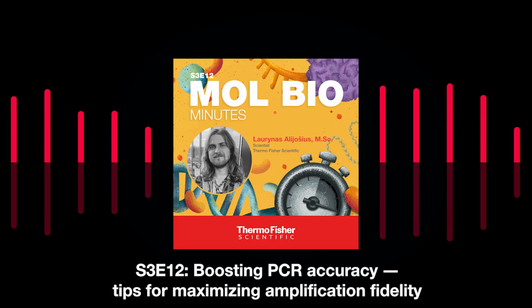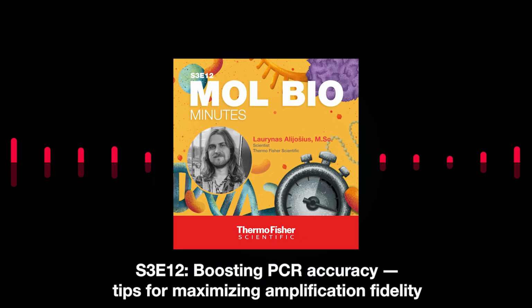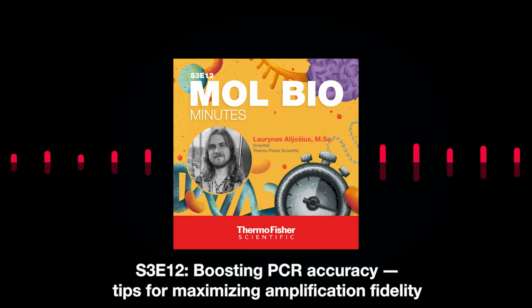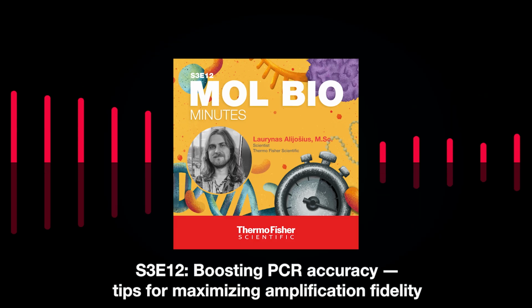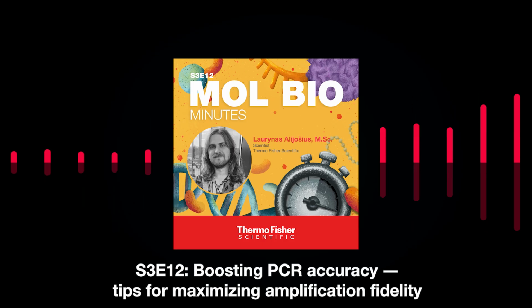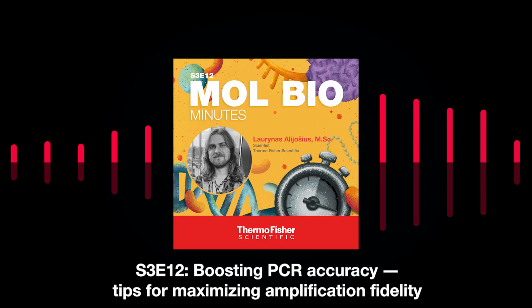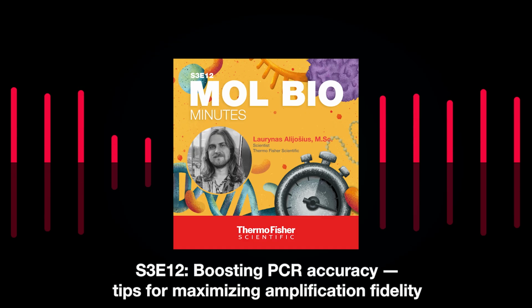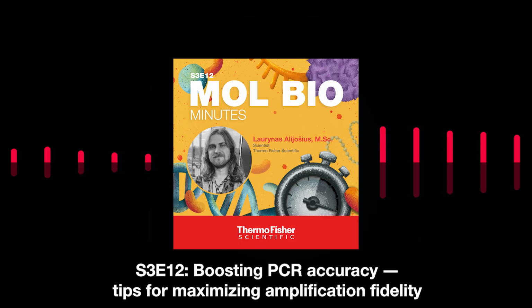There are other benefits as well. If you're using accurate DNA polymerases, you can also expand your PCR abilities in general. You can make both short and long PCR products. So if you use conventional Taq DNA polymerase, the Taq DNA polymerase can amplify DNA products up to 3 to 5 kilobases in length.